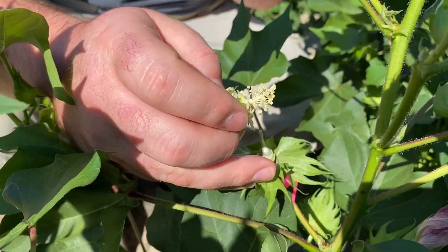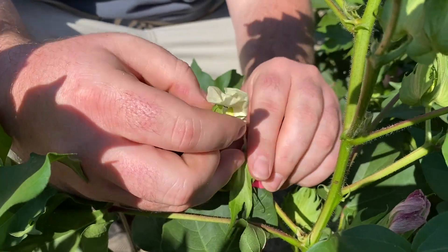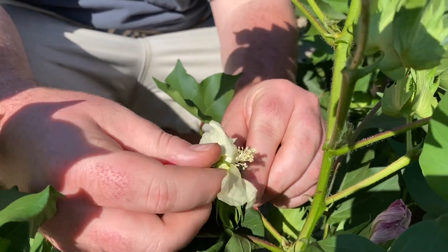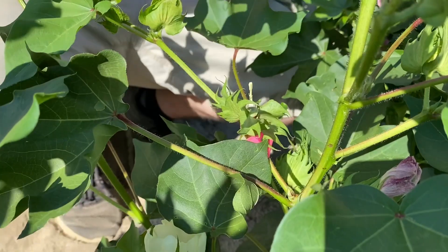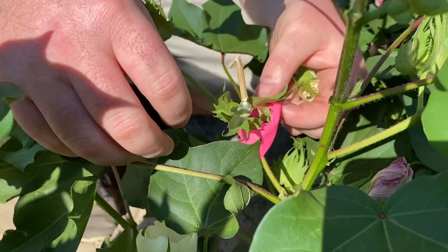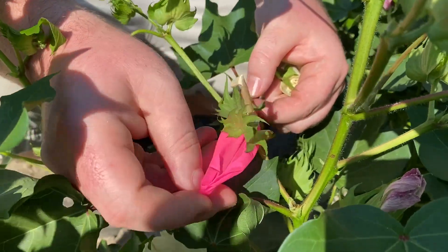Once the anthers begin to shed pollen, the paper straw can be removed and the stigma can be dusted with pollen from the male flower. Once dusted, we will cover the stigma and style with the paper straw again so as to prevent any foreign pollen from reaching the stigma. This will ensure that the pedigree of our newly formed cross is accurate.